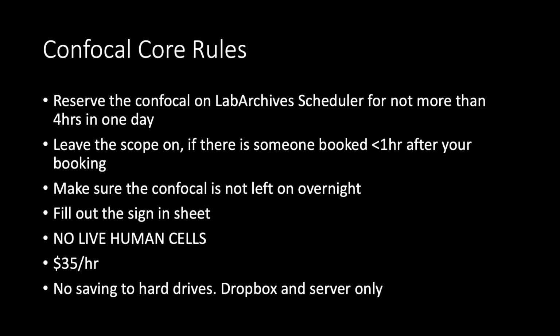In terms of saving data, we don't allow people to save to hard drives. Hard drives can introduce viruses to the Nikon software, and that's expensive and difficult to replace. So we request that people only save to Dropbox and the server. If you ever have any questions or concerns while imaging, please contact anyone in the White Lab, and ideally the Confocal Core coordinator.